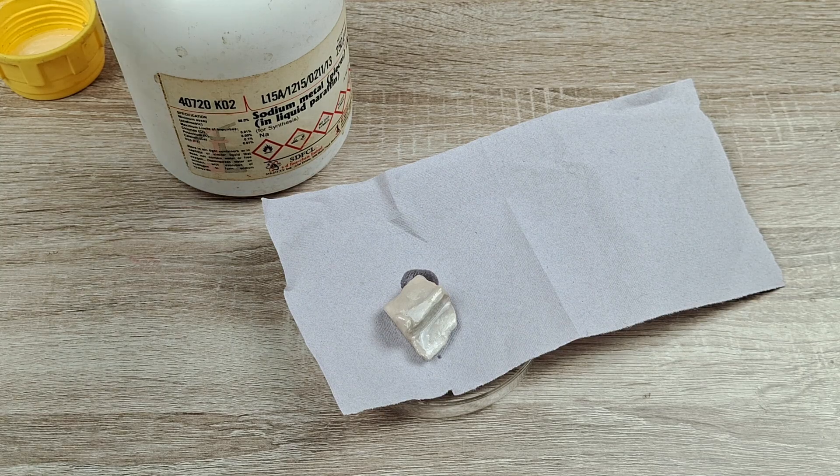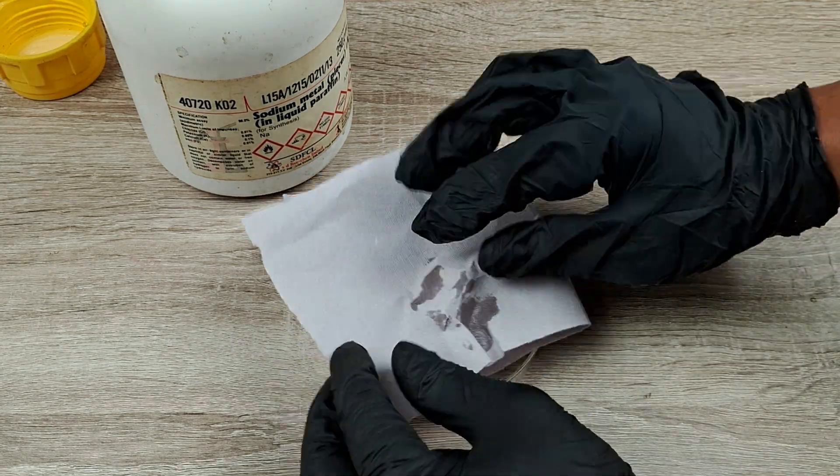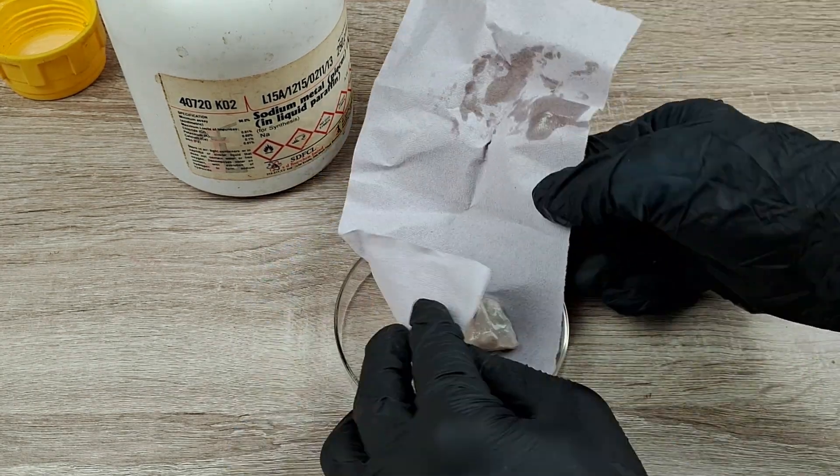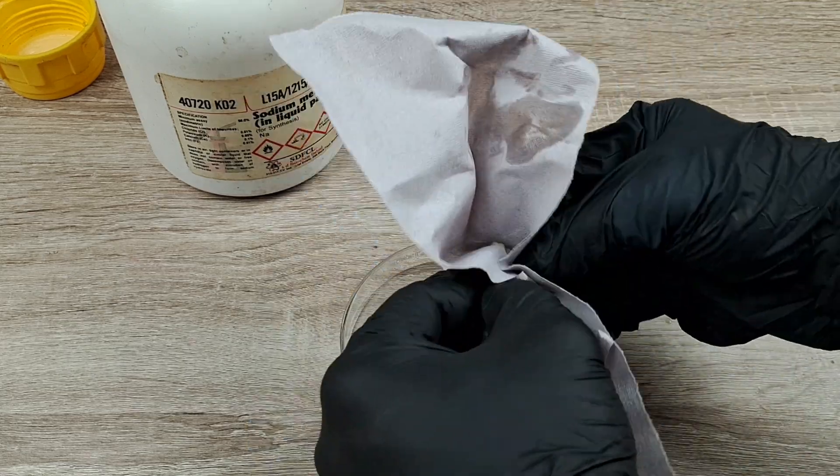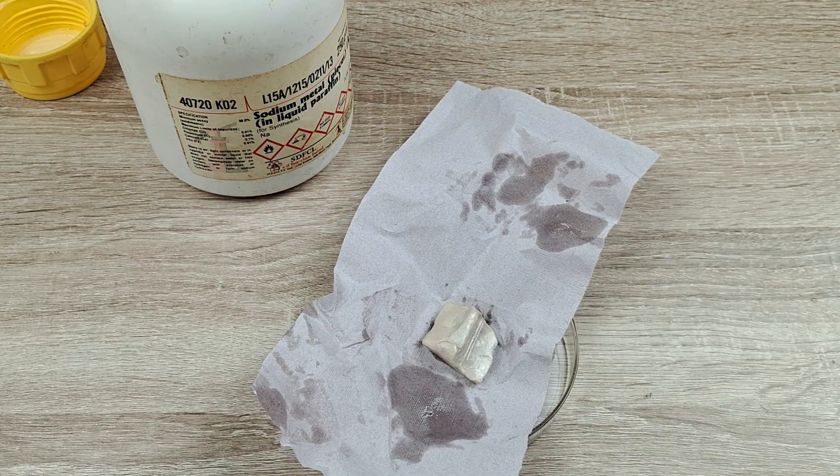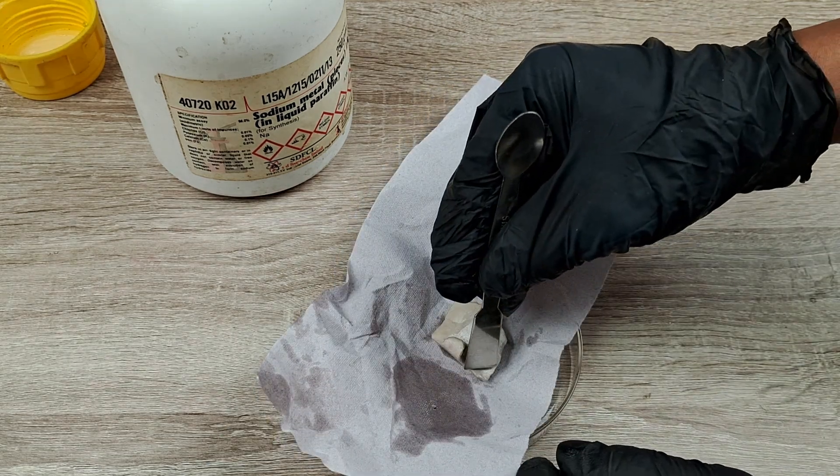Blot away the paraffin oil from the sodium metal. Next, using a knife or spatula, cut off a tiny piece of the metal.